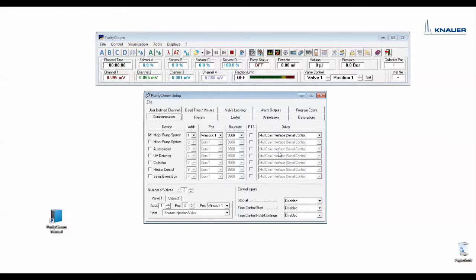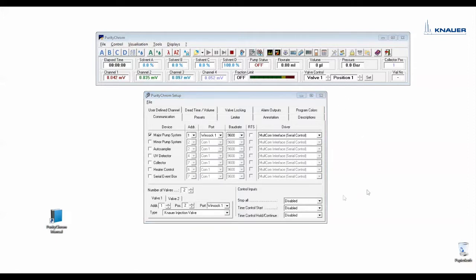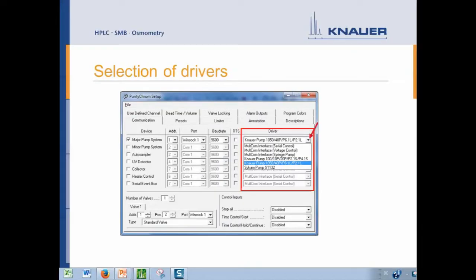As the software here runs a Steam version, I can't see the correct drivers because no devices are connected. Therefore, I will show you a screenshot. Here you can use for example the drivers for your different Knauer pumps.